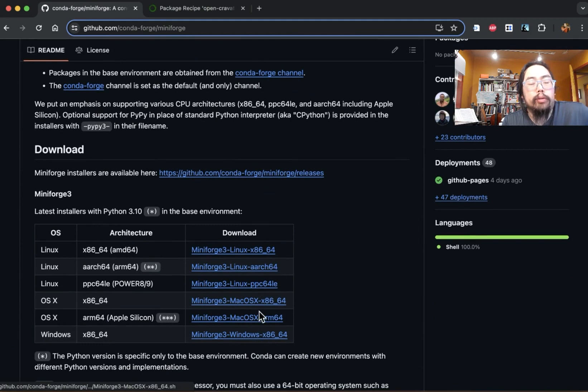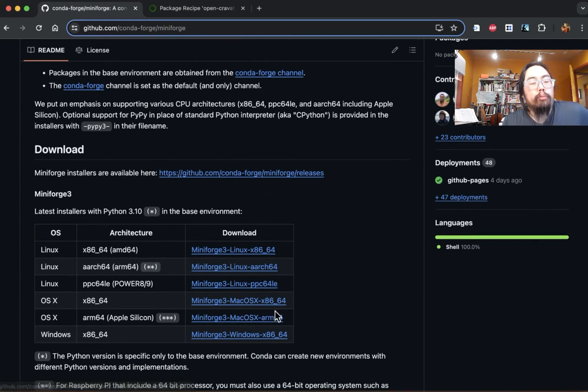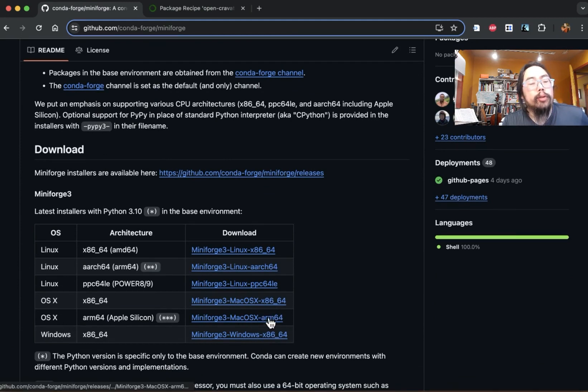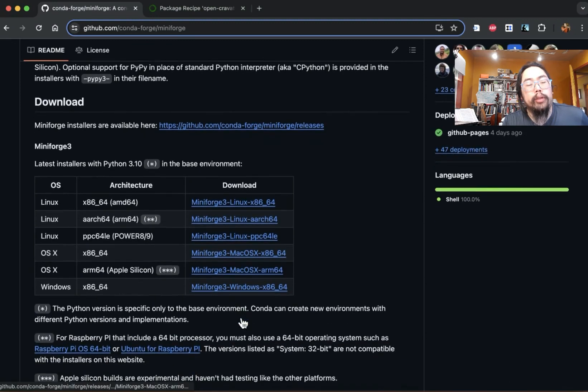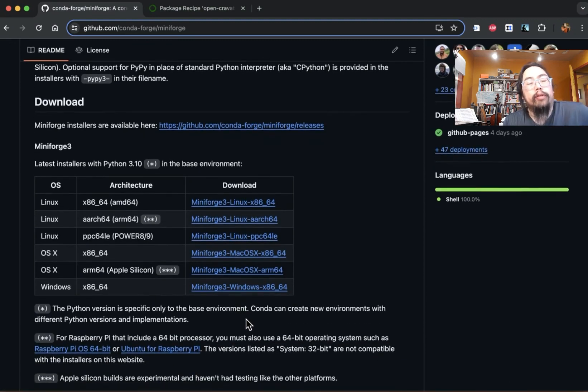There's also instructions if you scroll down a little bit, so you can install it via the command line. So I did this to install it to my own machine.